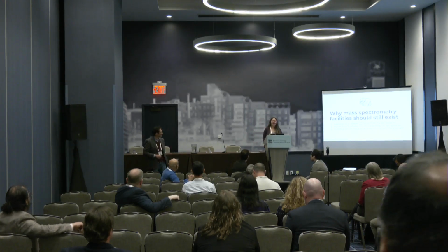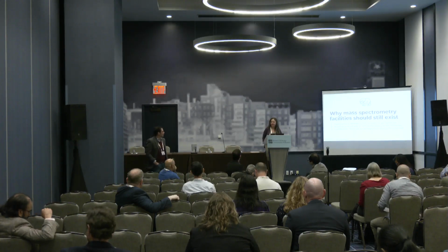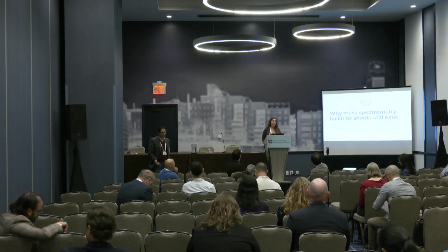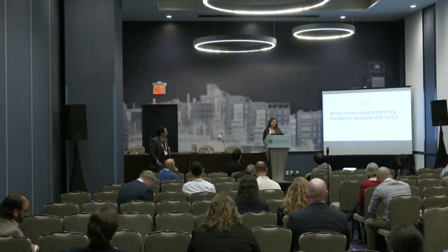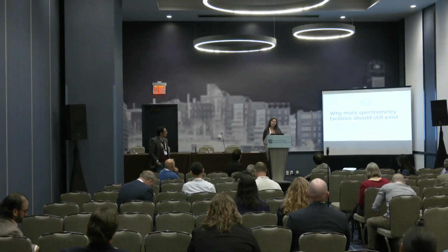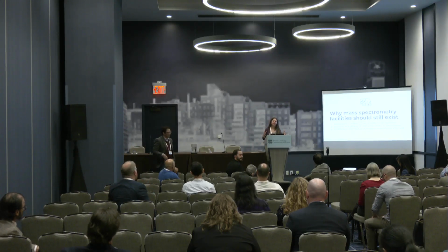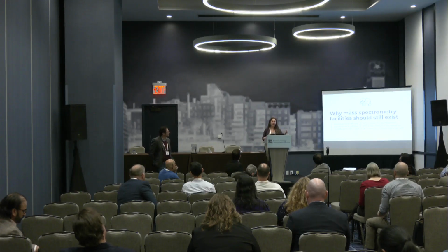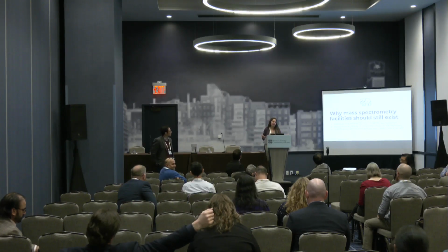Okay. There have been a couple papers. I know there's a SomaLogic Olink comparison paper, and there's been a couple papers comparing mass spec, but there has not, to my knowledge, been a universal benchmarking comparison of all of these technologies against each other. And I also wonder what the value of that would be. They kind of all specialize in their own areas, their own niches. So it's a little bit like comparing a screwdriver and a saw for hammering in a nail. That's not the right test you should do. You can benchmark that, but is it really useful?